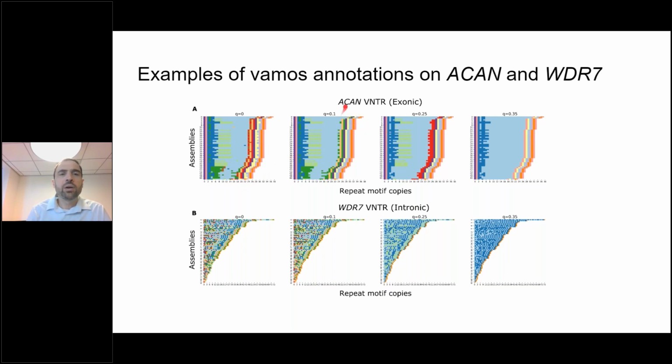You can see that when we compress a little bit, we start to see increased purity of some of the core domains of this tandem repeat. We think we're actually getting rid of some consensus errors in the assemblies, where this should potentially be a long conserved core domain of an exactly repeated sequence, but there are slight differences when we use the initial set of motif sequences.